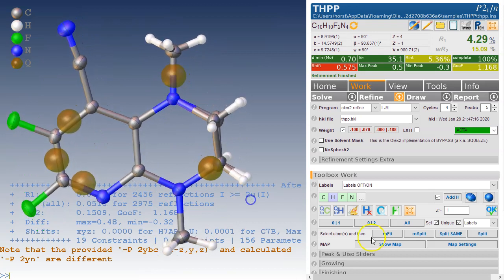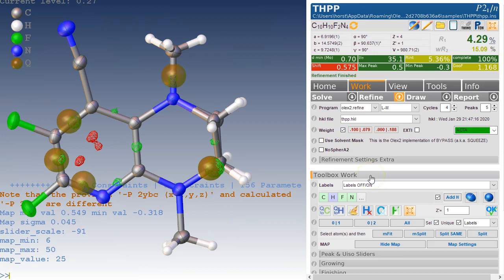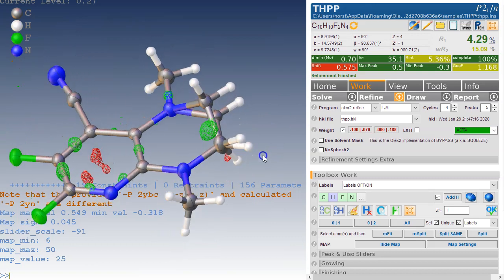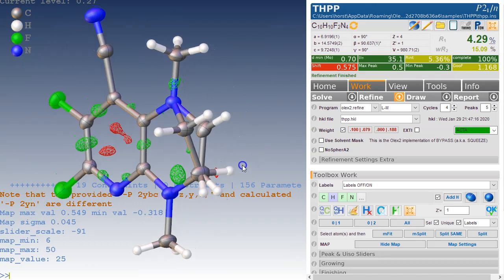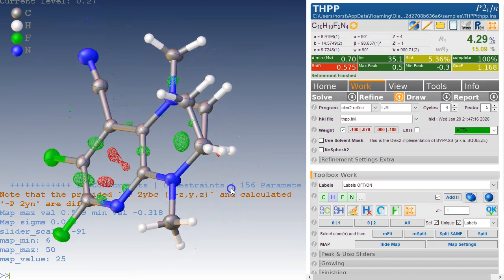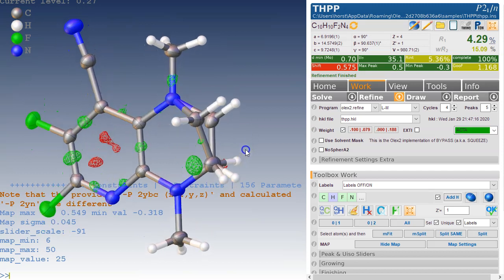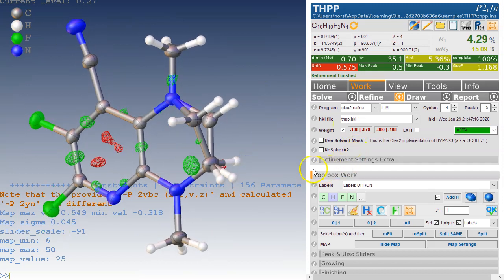Another tool that we have in OLEX2 is Ctrl M, which is looking at the electron density map, and Ctrl Q to hide the peaks again. It turns out that this peak is actually quite visible. So the question is, could we maybe model this differently by actually having a carbon here, and then that would be bound to that carbon and that carbon to that carbon, and then we would actually have the same chemical compound. If we wanted to do this, there's many different ways of doing this and I'm going to walk through some of them.